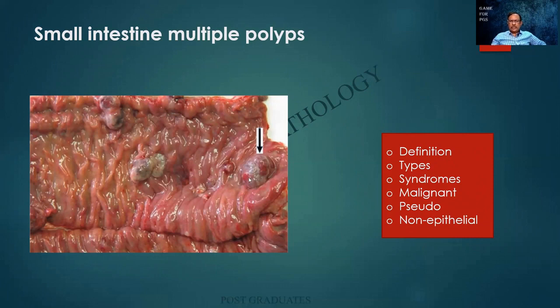I had taken a class on these polyps also. This, I would say, is more or less benign, but this patient happens to be having a mucosa carpeted with polyps. And when it grows larger and becomes more variegated, with blackish areas, red areas, etc., it is more prone to malignancy. And it has to be followed up, biopsied and studied.